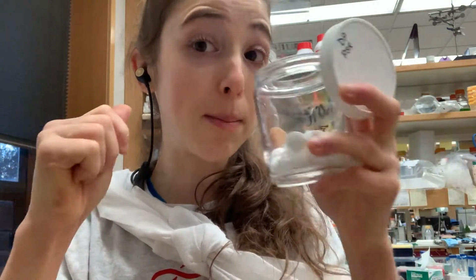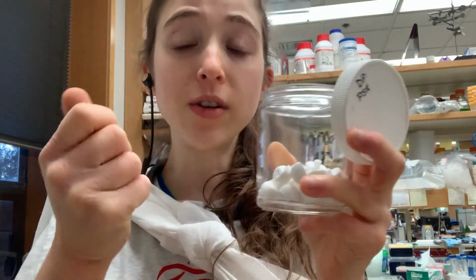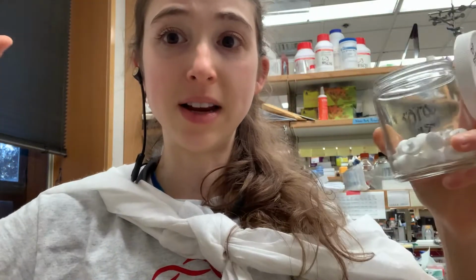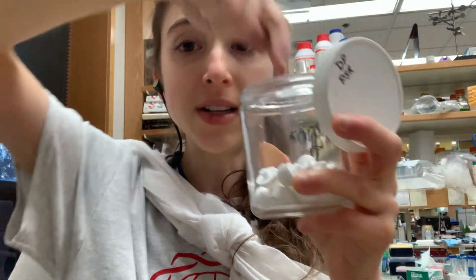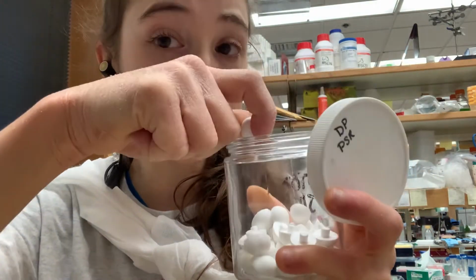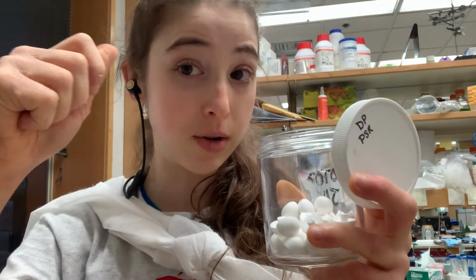The point with a buffer is to keep the proton level constant. And in order to do this, you need to be able to counteract any outside forces. So if an acid comes in and donates a proton, you need a base that can come and remove a proton, because an acid is something that donates a proton and a base is something that removes a proton.